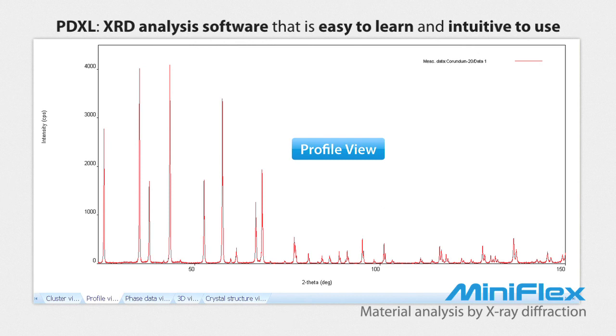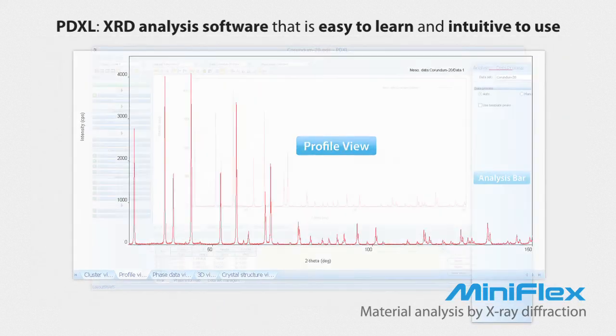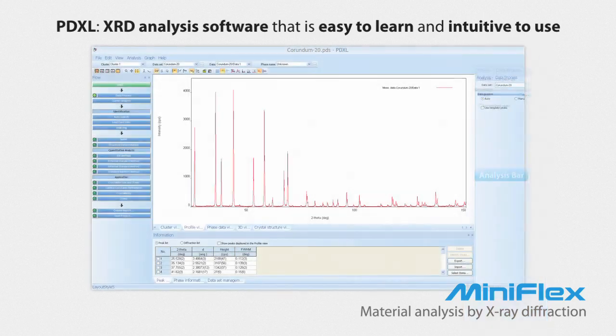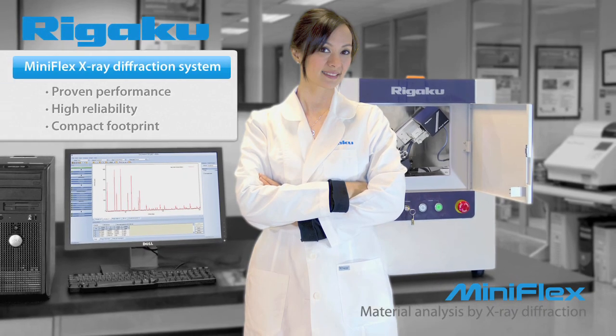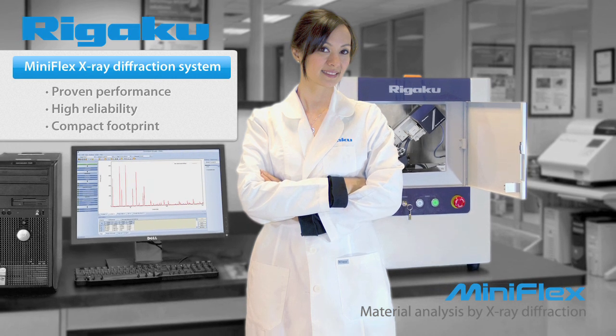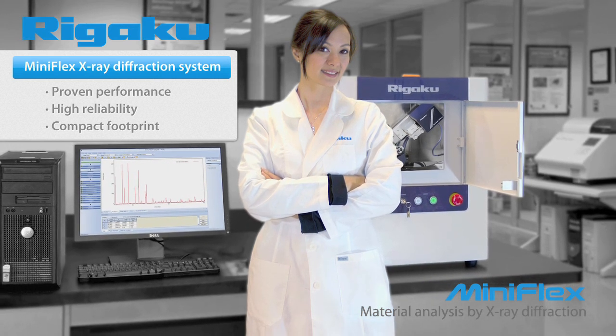Common types of results that you will obtain from PDXL include compound identification, crystallite size and strain, percent crystallinity, cell refinement, and quantitative analysis. With proven performance, high reliability, and a compact footprint, the MiniFlex has redefined the concept of X-ray diffraction.